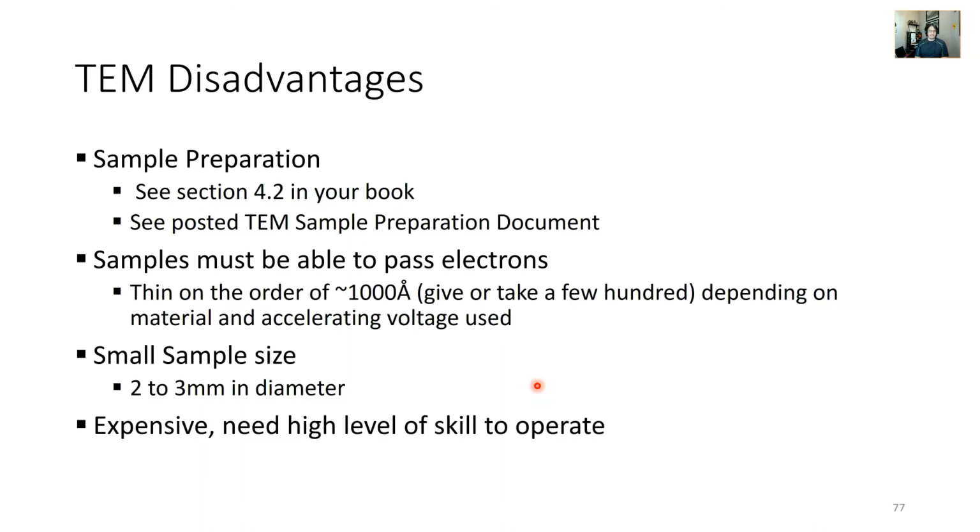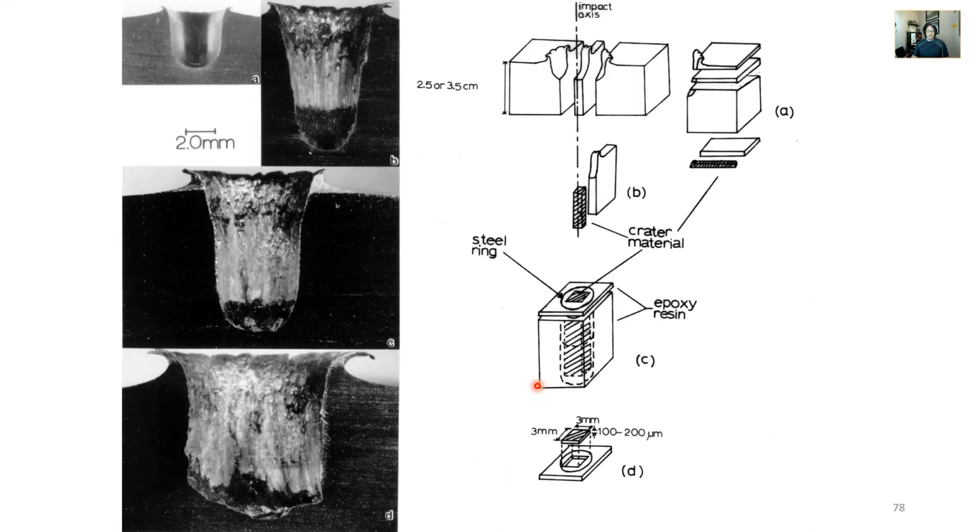So it takes a lot of time and patience. If you're going to do TEM microscopy yourself, I would give yourself a day, the whole day, to look at your specimens. And it's painstaking. This is after you've spent a lot of time making specimens. And anyone who's made specimens for transmission microscopy, whether it's TEM or STEM, can tell you the horror of losing your specimen or damaging your specimen. And sometimes, depending on what you're looking at, the actual beam of your instrument can damage your specimen. It's very heartbreaking.